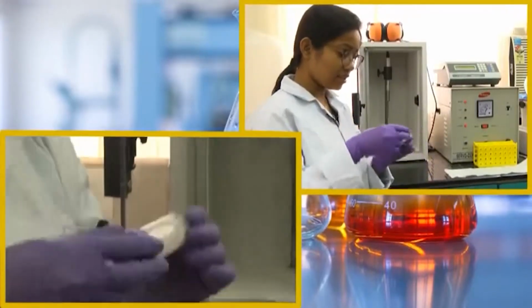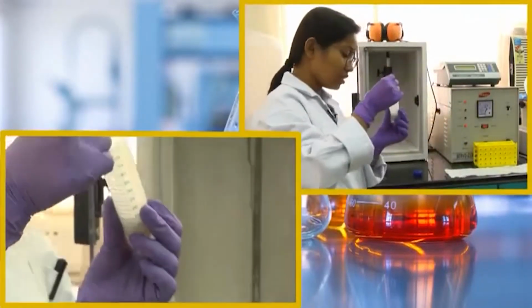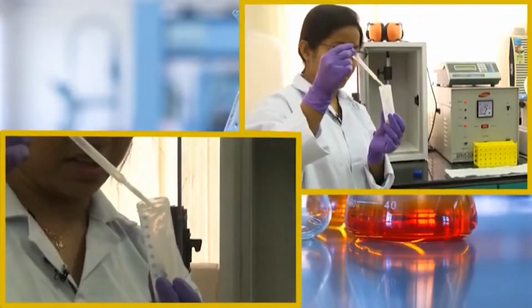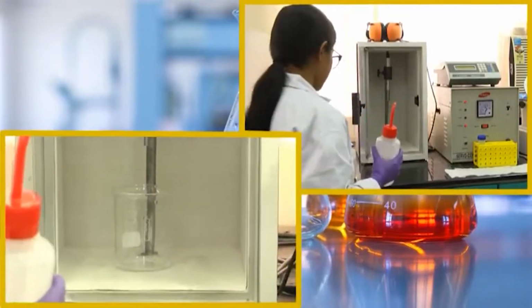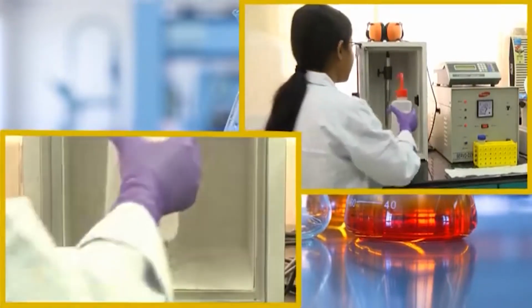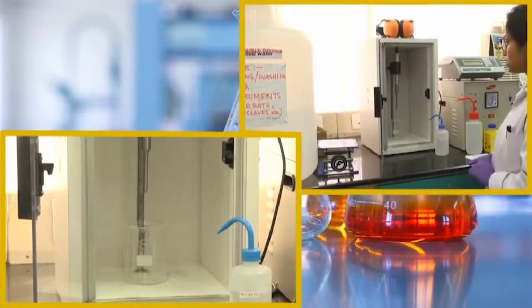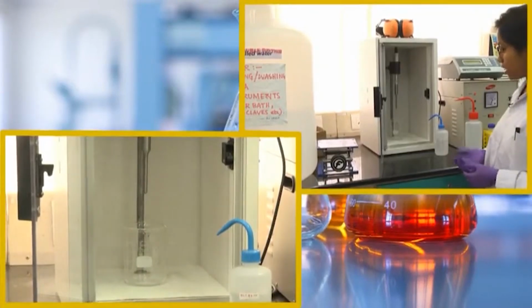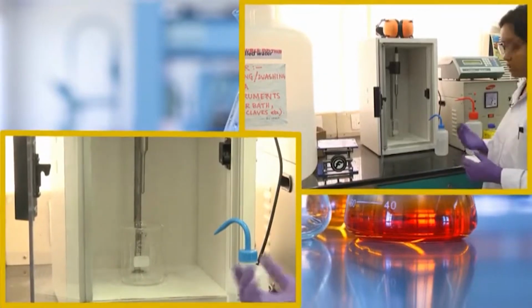Now that our cells have been lysed, and you can see the solution has become viscous, we will go for this sonication. Before you put the solution for sonication, you need to clean the probe of this instrument, because other people might be using it for their own cultures, and it is good practice to always clean whatever you are using. Although they have cleaned it after using it, there might be some dust and other particles which might contaminate your proteins or your solution.